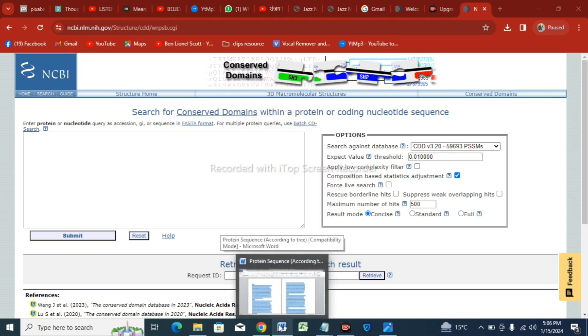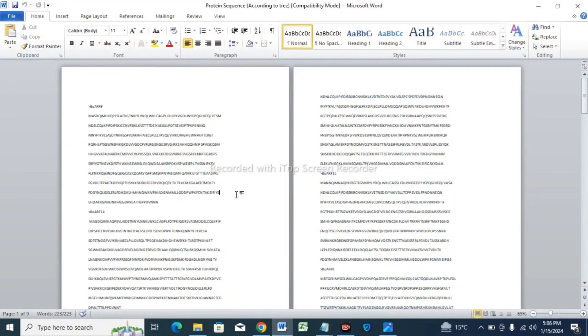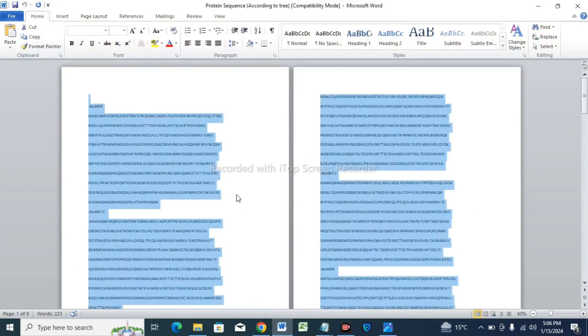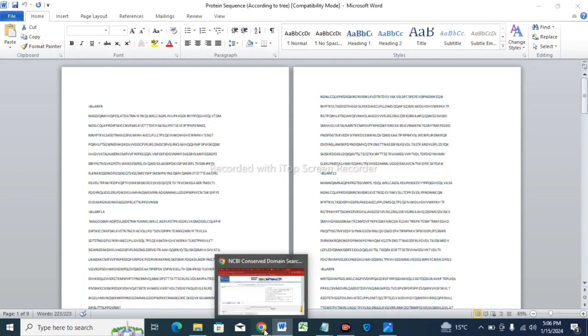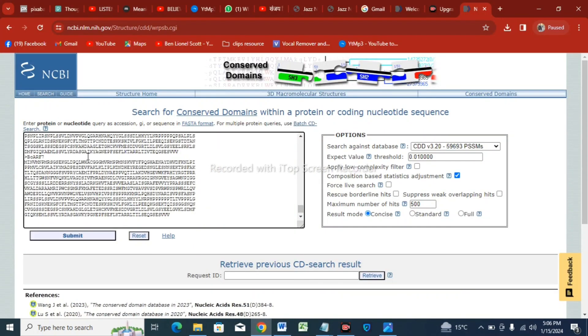Copy it and paste it in this box, and then tap on the option Submit.